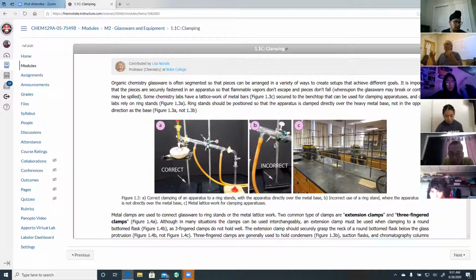So the monkey bars, or the aluminum or cast iron scaffold, is there just to place your glassware with security. It's just to hold on to your glassware. So you use different clamps to hold on to your glassware against a fixed surface or a scaffold.